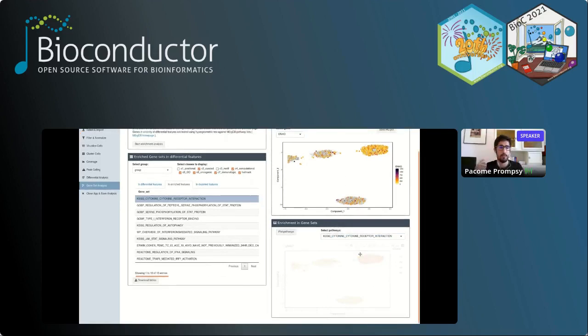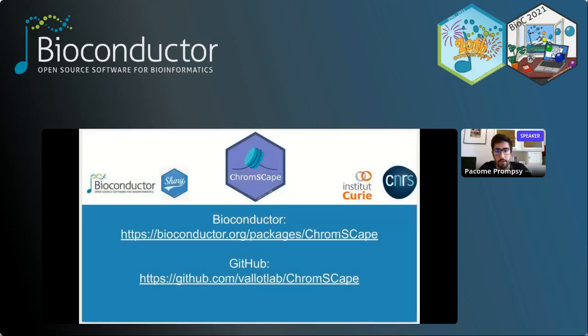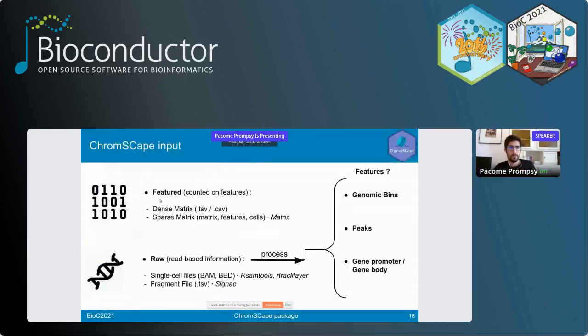So I hope this was not too quick and gave you a good overview of all of the features of ChromSCape. So now I will share my screen again. I just want to come back to a few of the features to give you a bit more detail.